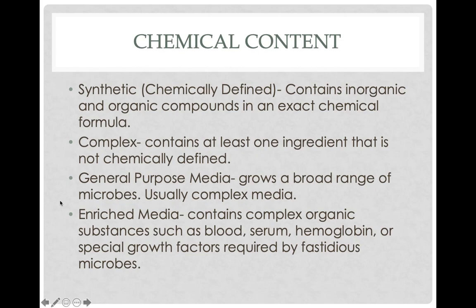You have general purpose versus enriched media. So general purpose media is things like nutrient broth, tryptic soy agar, blood agar, where pretty much, not blood agar, where pretty much everything can grow on it. You put a sample of your skin bacteria on nutrient agar, pretty much every single one of those species is going to grow.